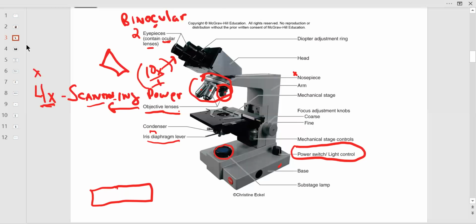So you take a toothpick, right? And you scrape the inside of your cheek. And then you might add a little saline. I don't like to put any stains in this, but again, the virtual lab may tell you to do that, which is fine. It just gets all over your clothes and it's really not necessary all the time.